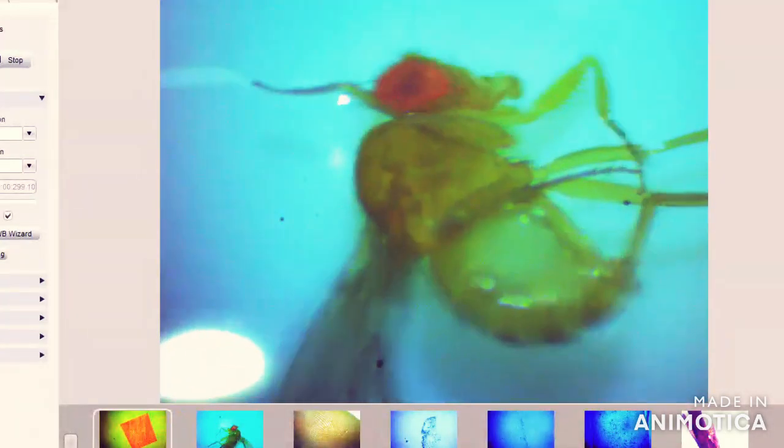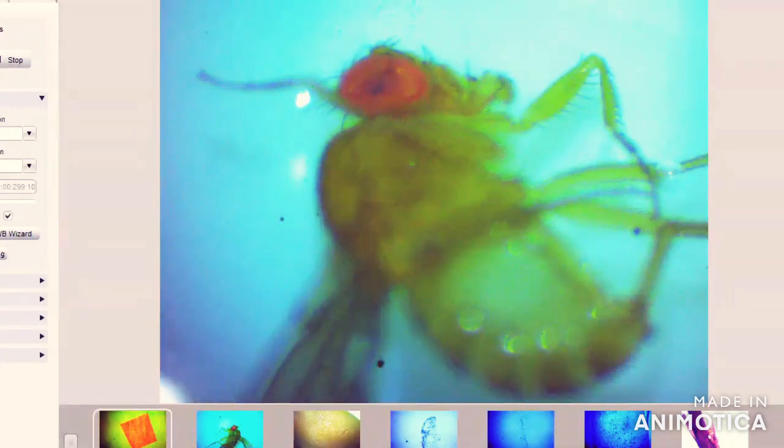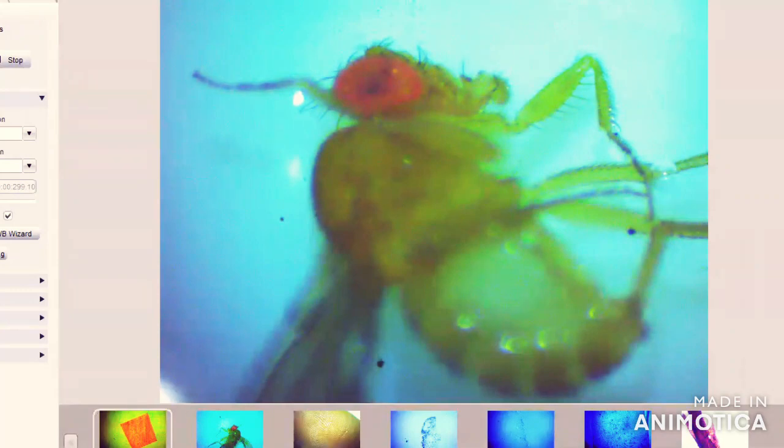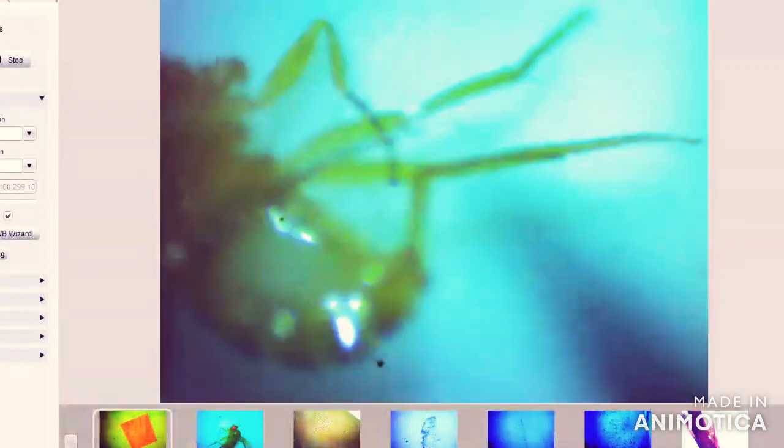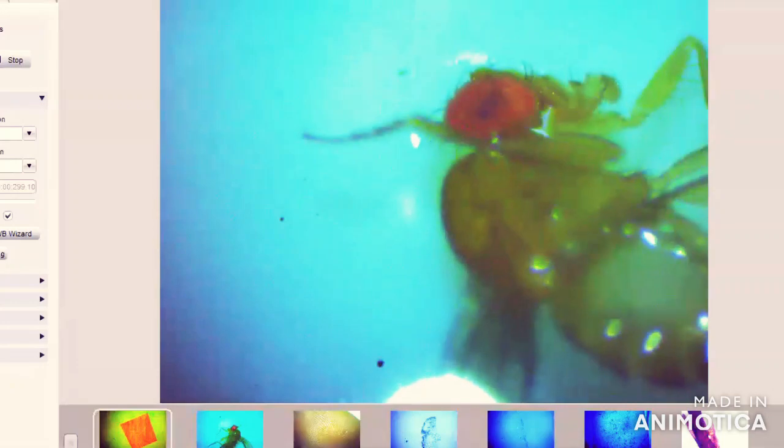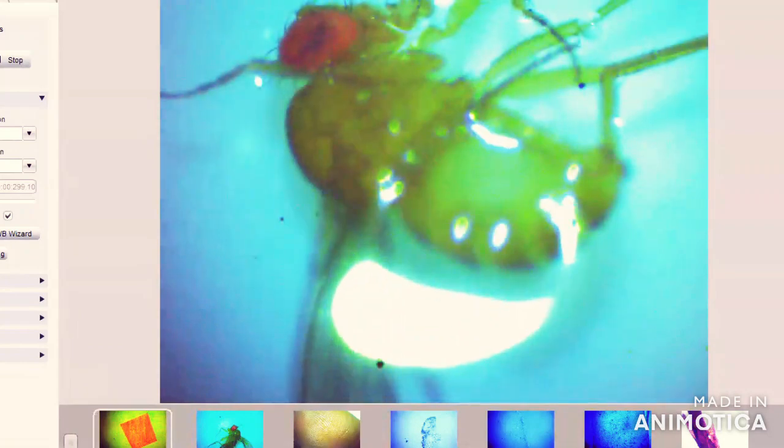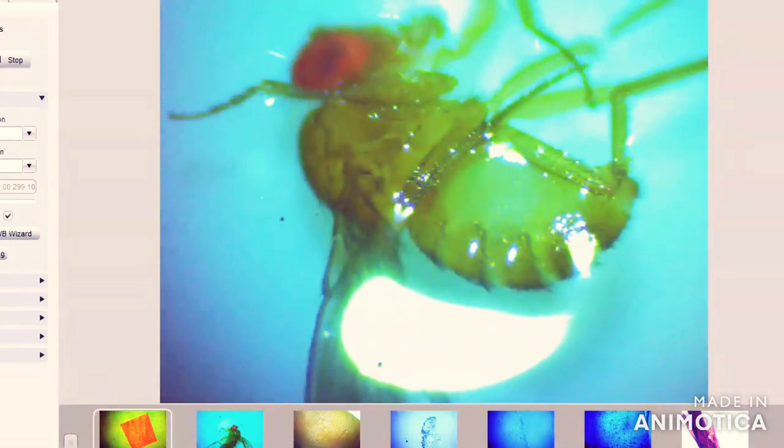Now if you focus on their legs, it's a female Drosophila because if you see the first tarsal leg, if I try to keep my needle close to its first tarsus, you can see here this is their eye and this is the first tarsus. It doesn't have any sex comb, so due to the absence of the sex comb you can see it is a female Drosophila.